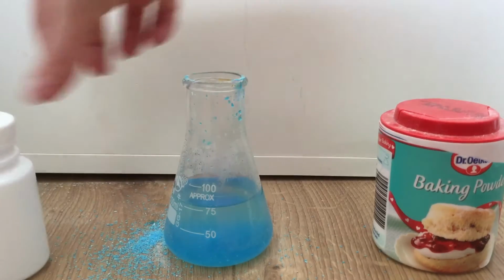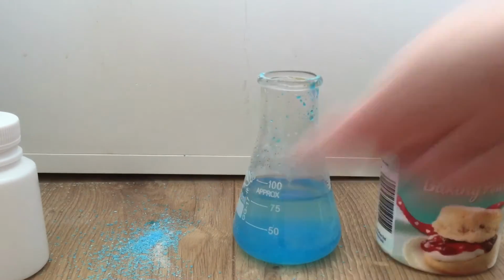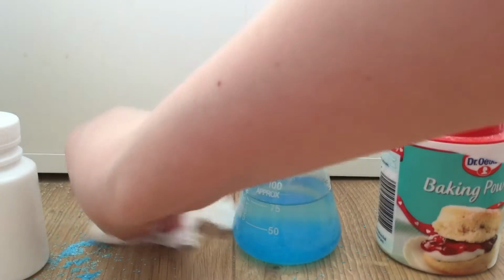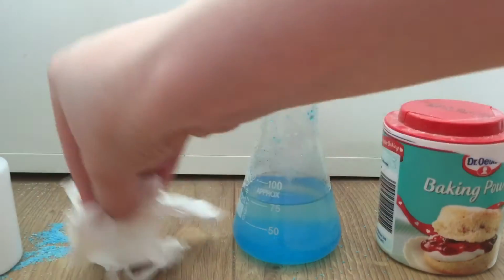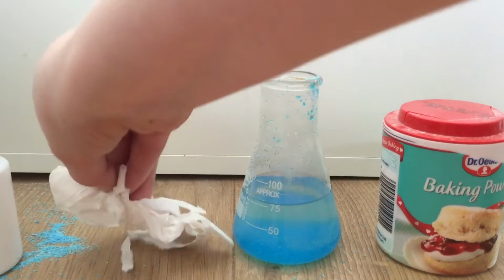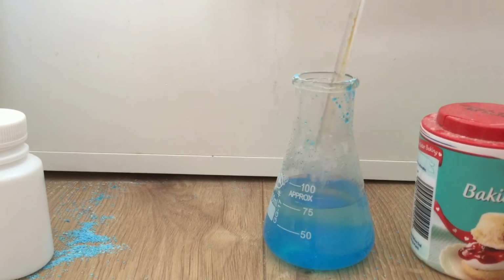Copper sulfate does cause skin irritation, but honestly it's not really that bad, so you don't really need to worry. I'm not using gloves because I'm not planning on getting anything on my hands, although accidents are called accidents for a reason.